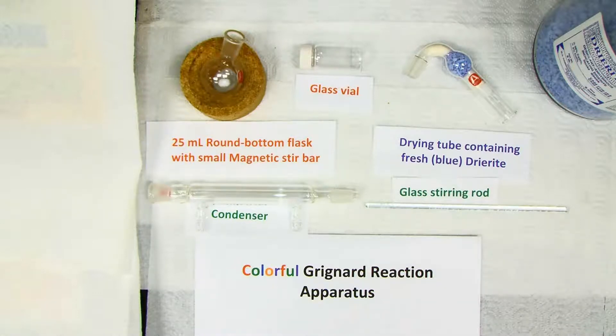Drierite is anhydrous calcium sulfate, a substance that can absorb water. It is blue when free of water, but due to a trace of cobalt chloride indicator, it turns pink when it has absorbed enough moisture to need replacement.